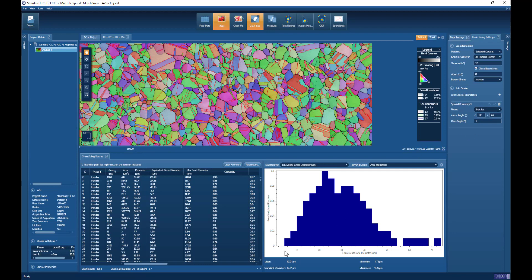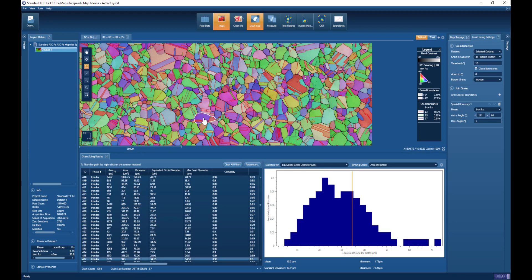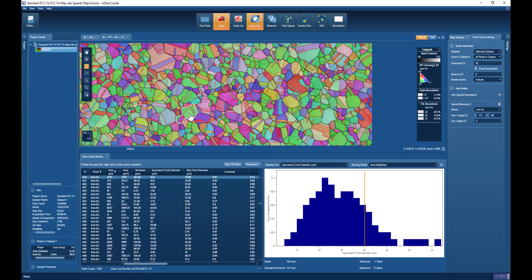It has now recalculated the grain size, but excluding these twin boundaries. If I switch to the grain click mode, you can see how it is ignoring those twin boundaries when we're selecting individual grains.